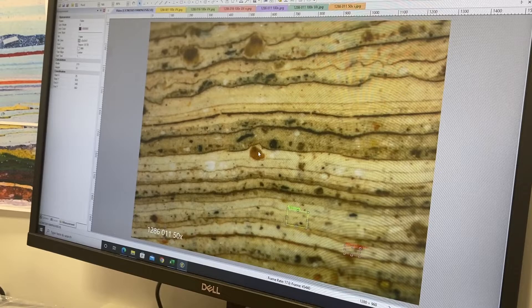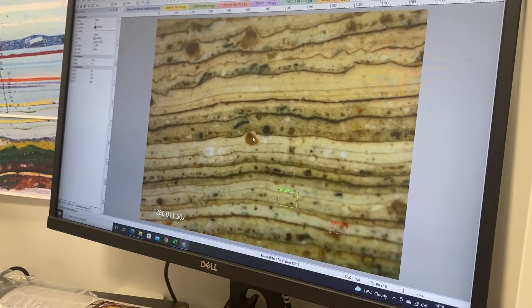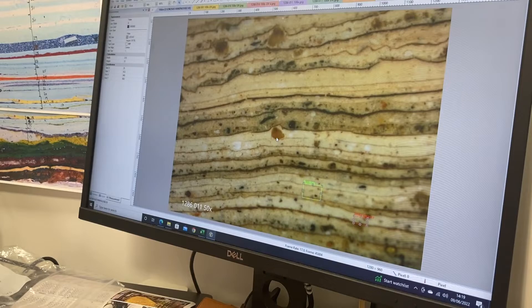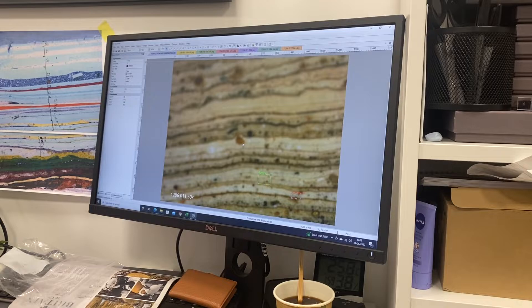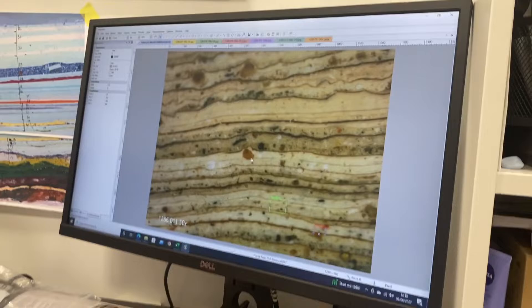So these ones here are where we think the graining was. The thick line — was that varnish? Yes, that's varnish. It doesn't look clear, it goes dark when you look at it in the microscope. These more layers of sand here — is that just a random bit of dirt? Yeah, sometimes it's just little bits of inclusions and silica and stuff, with a bit of red oxide in there, just a little bit of stone. You can see pigment particles in there, but they're generally quite rough earth pigments.